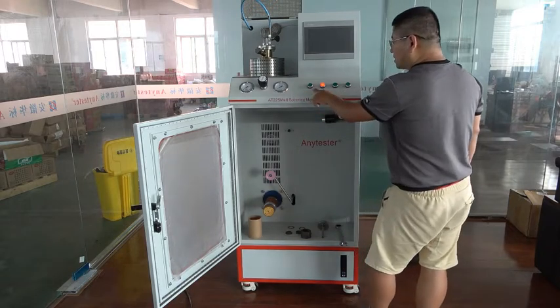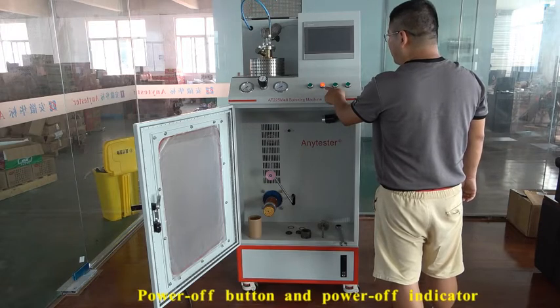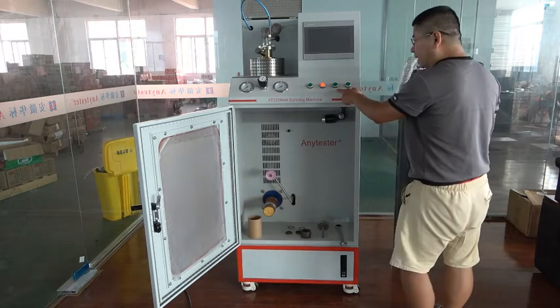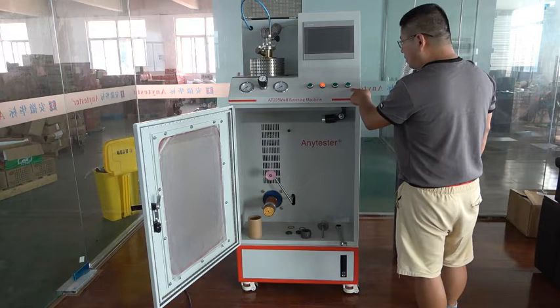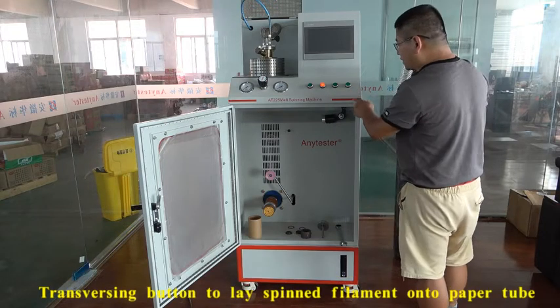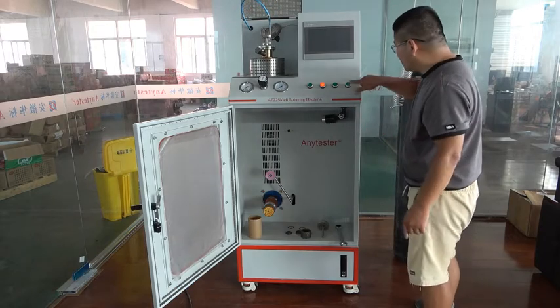This is the power on button. This is the power off indicator button. Power off button. Heat button. This button is for traversing. For traversing, press this button.